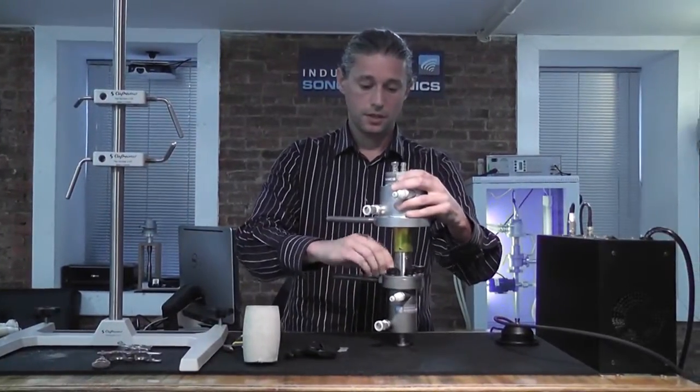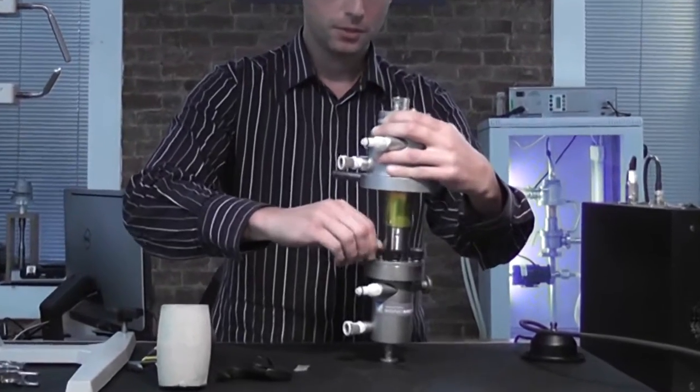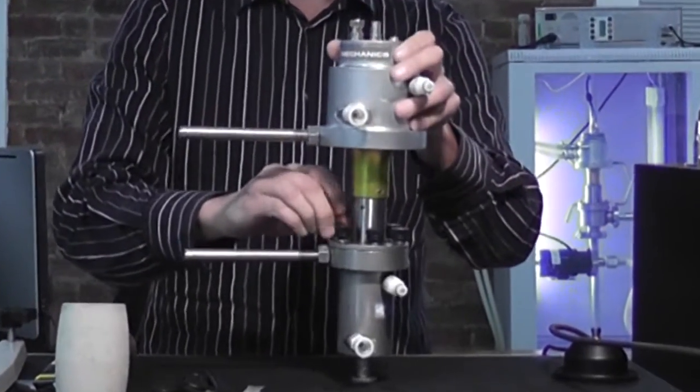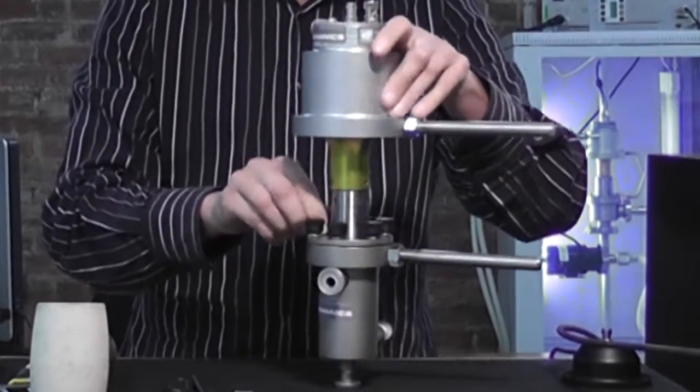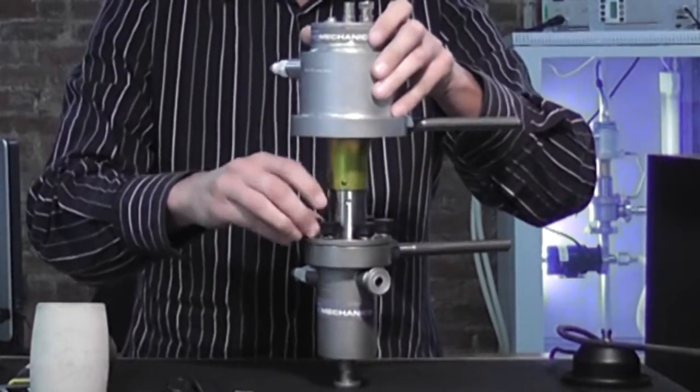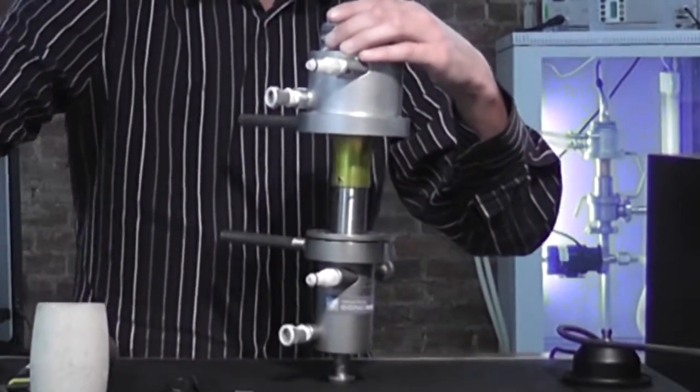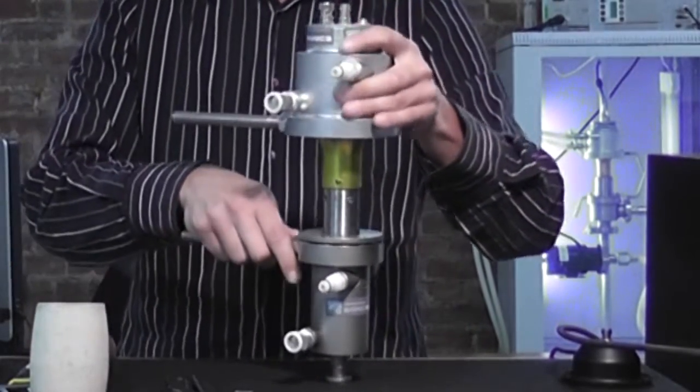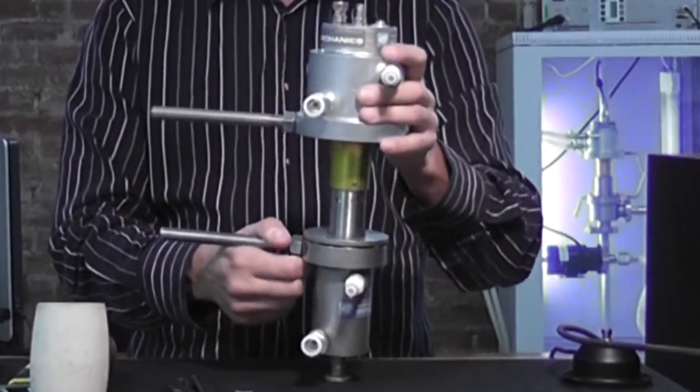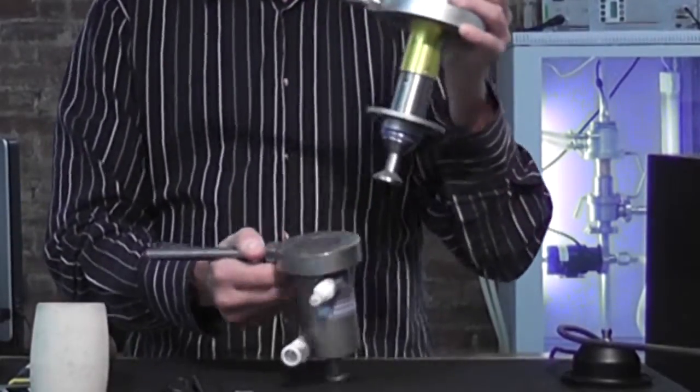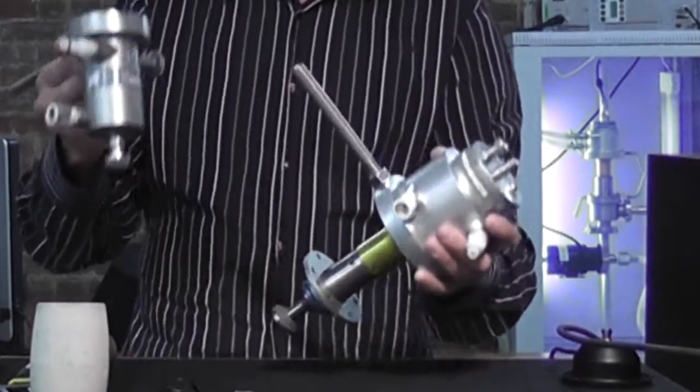Next, take out the thumb bolts that hold the horn and the transducer inside the reactor chamber. This can easily be done by hand. At this point, the transducer and the horn can be taken out of the reactor chamber. We're done with this part for now.